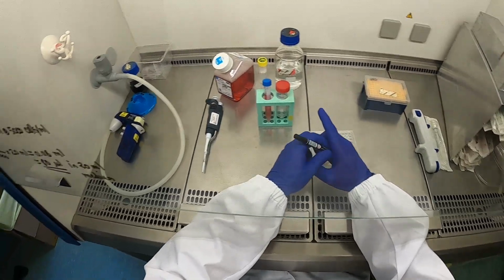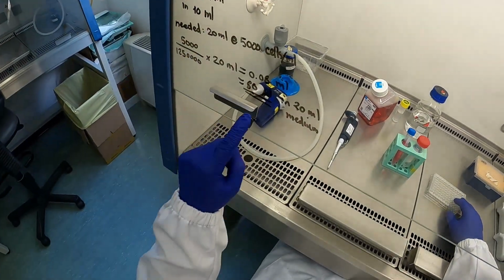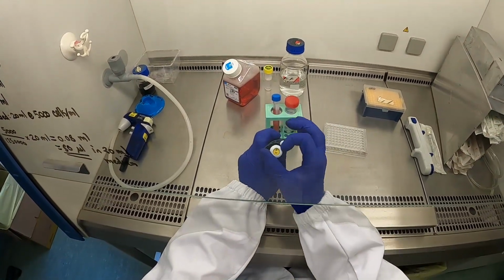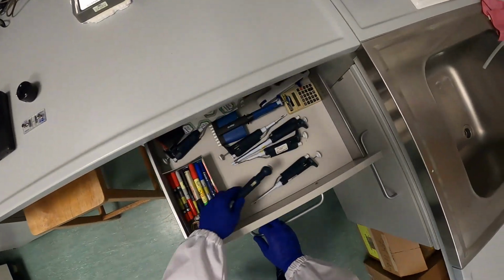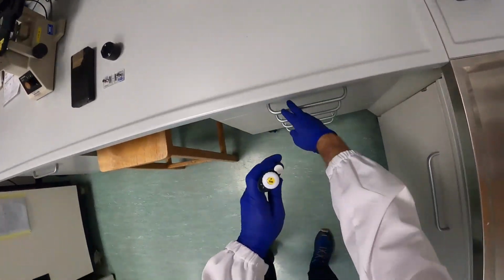And then, how much did you calculate you needed to introduce? Correct, 80 microliters. So the P20 that you have is no good. We need to get the P200, which goes from 20 microliters to 200 microliters.